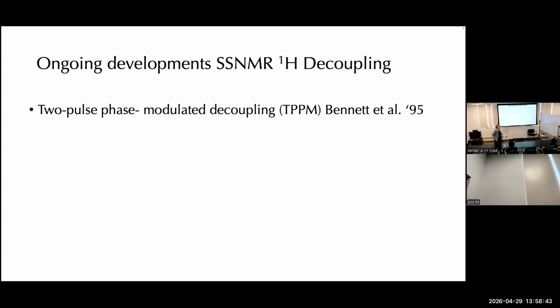The intuition is that if you could make the cycle time seem faster, even though we're not allowed to turn it up and just make the CW twice as strong, could we do something within each 2 pi pulse, so that there's sort of a shorter cycle time within the one Rabi precession period? Would that help in some way? You have a shorter pulse element inside of each 2 pi.